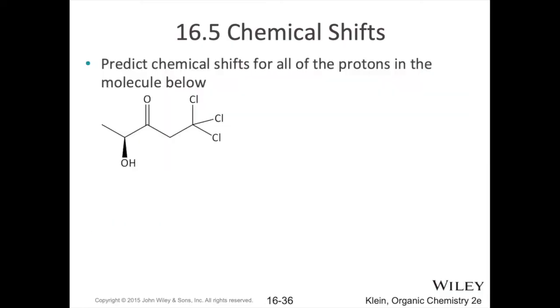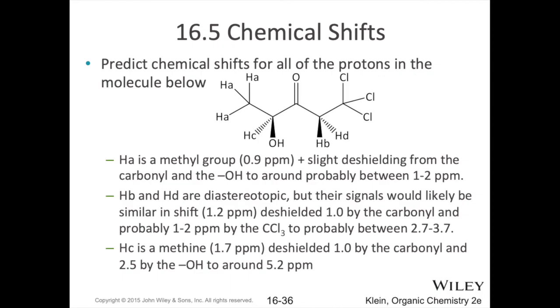All right, so let's put this into practice. Based on the information in the past couple of slides, see if you can predict roughly where all the protons in this molecule should show up. Go ahead and pause this video for a second, identify all the protons, and see if you can figure out where they'd all show up. Okay, if you're back now, here are the answers to that problem.